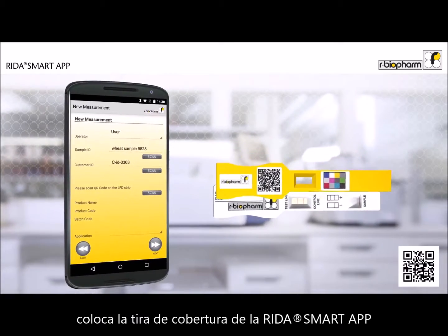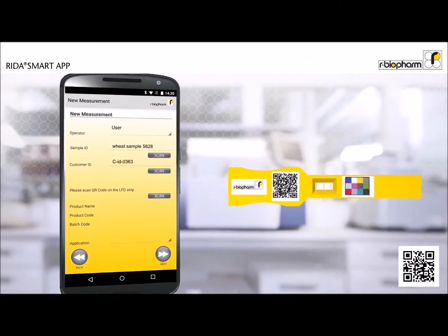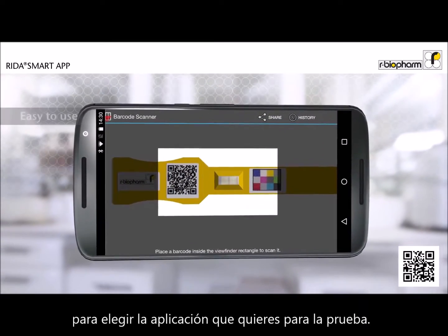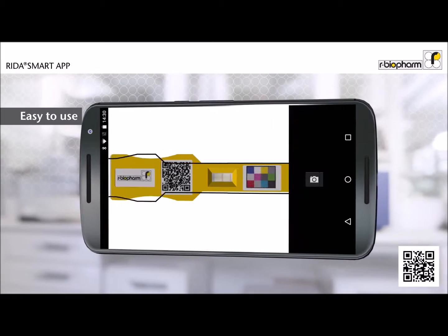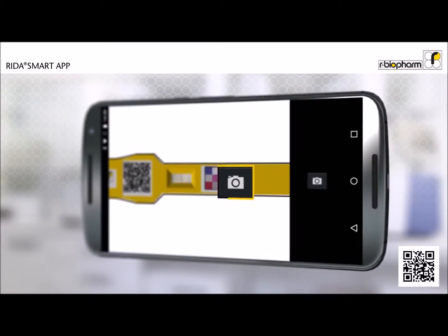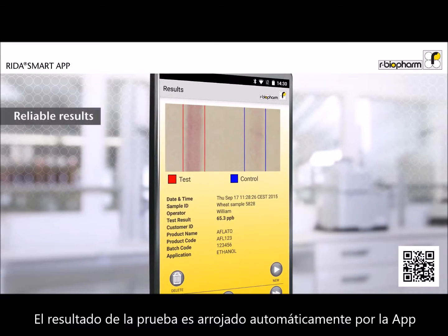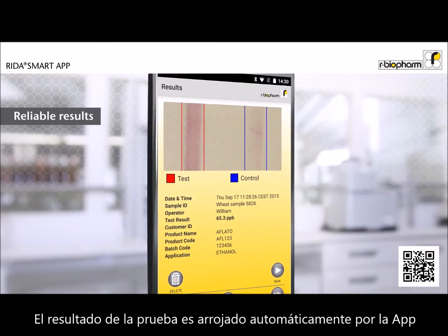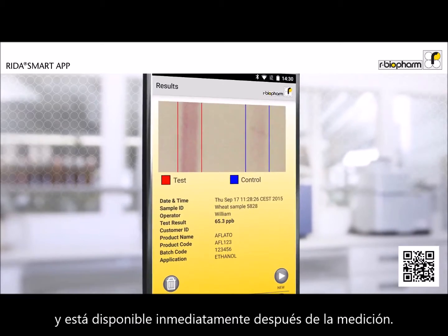Place the RIDAR Smart App cover strip on your test strip. Scan the QR code to choose your desired test application. Scan your test strip. The test result is automatically determined by the app and is available immediately after measurement.